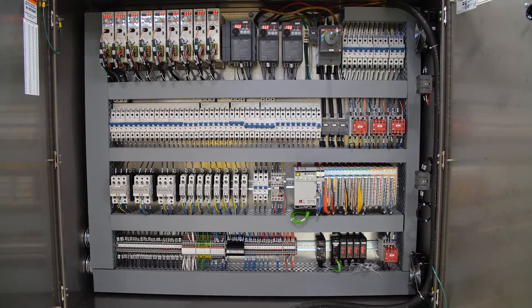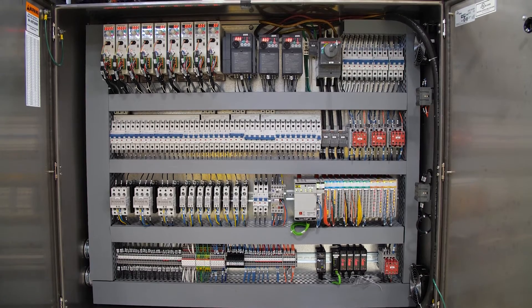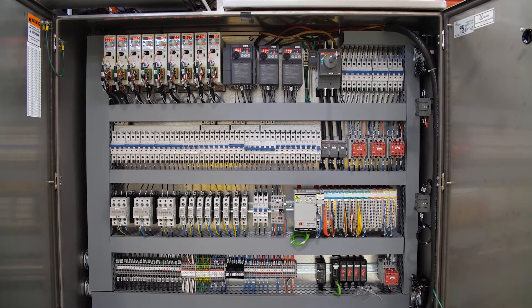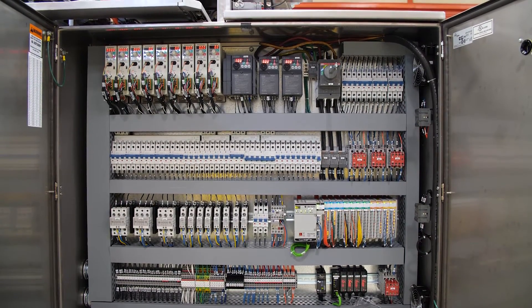The new line is available with your choice of Siemens or Allen Bradley PLC and HMI, providing more flexibility to the end user.